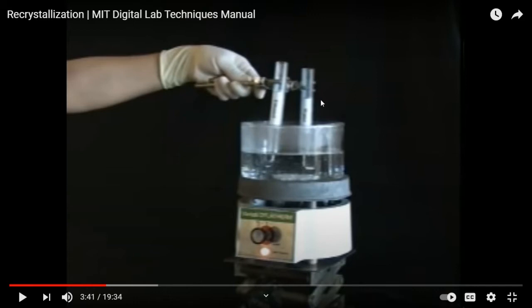And then it's organic liquid, and it's going to have contact with the hot plate down there, and it's going to be boom. You think I'm making all this up, but this is something I have watched in movies as safety training since grad school. Okay, that actually happens. So I'm going to make a deduction if I see some improper, unprofessional conduct of experiment, not just running, not wearing goggles, not only those things.